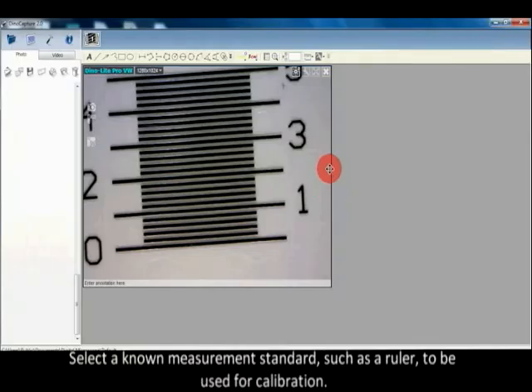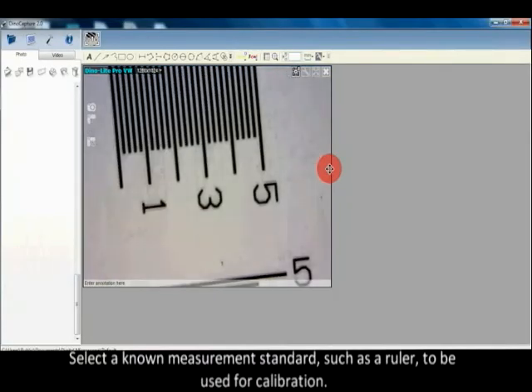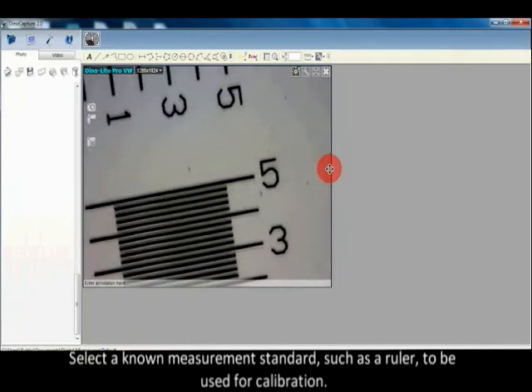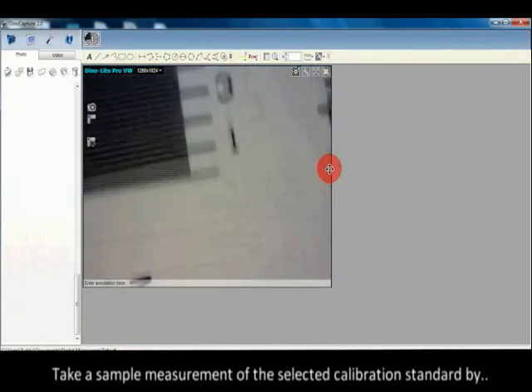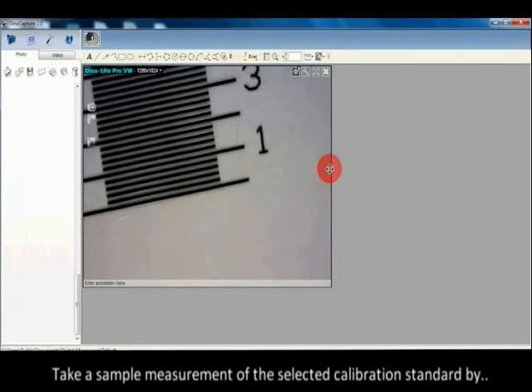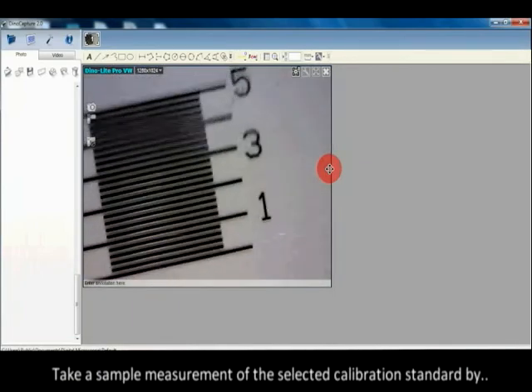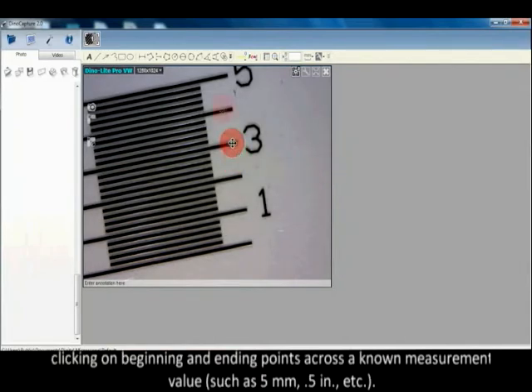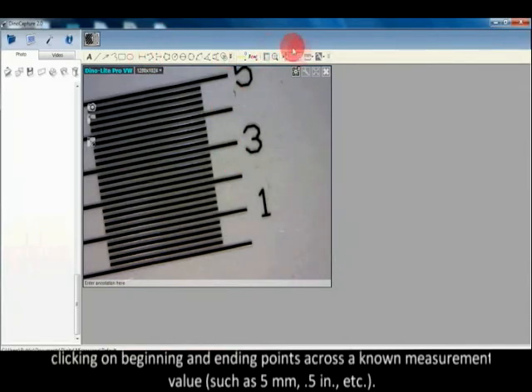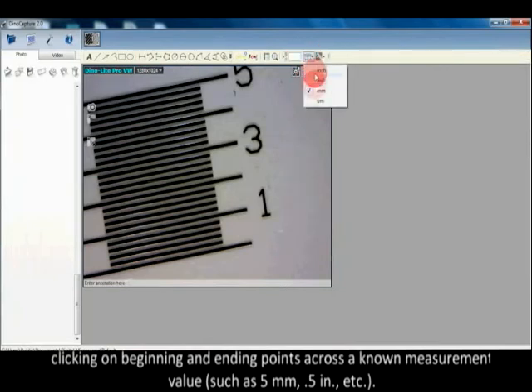Measurement and calibration: Select a known measurement standard such as a ruler to be used for calibration. Take a sample measurement of the selected calibration standard by clicking on beginning and ending points across a known measurement value such as 5mm.